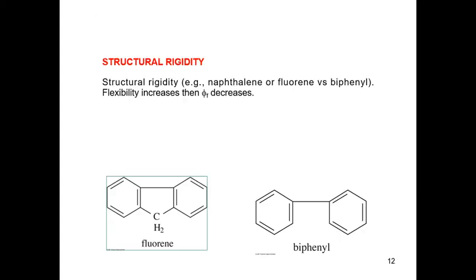Before I move on, the explanation for lower quantum efficiency or lack of rigidity is the enhanced internal conversion, which increases the probability of radiationless deactivation. Biphenyl gives very little fluorescence because it is a weakly rigid structure and it enhances radiationless deactivation. Non-rigid molecules can also undergo low frequency vibrations, which account for the energy loss. That means non-rigid molecules lose a lot of energy, and because of this loss of energy, there would be very little fluorescence.